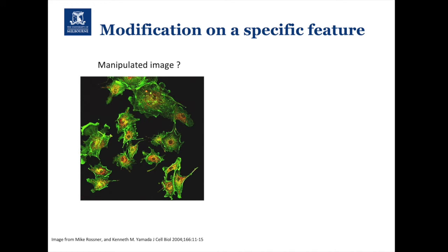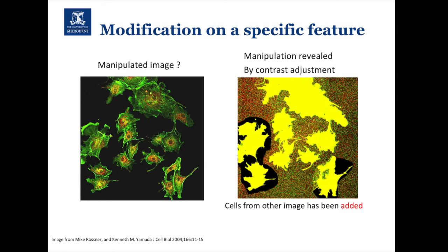The next example is a fluorescence microscope image of a group of cells. The image looks reasonably okay, there's a little saturation at some points, but if you do a simple contrast adjustment you can see the cells in the bottom-left corner and the group of cells in the bottom-right corner have a different background to the rest of the image — suggesting they've been cut and pasted in from another image. Again, this is obviously not ethical, and it's a very easy check to perform. A lot of journals now have editors whose job is to look for exactly this in submitted articles.